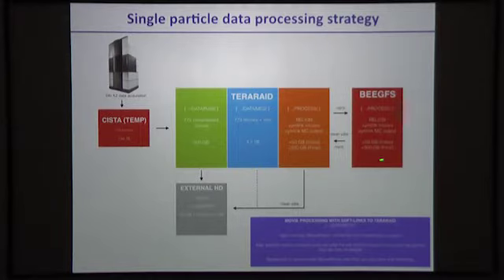But the point is that we generate very heavy movies that we don't need to put in our fast storage, and we can keep them in the slower storage servers and only move to the fast storage server the data that we need. So movies, in most cases, we shouldn't need to move over there. That way, the whole system can keep working without interruptions for everyone.